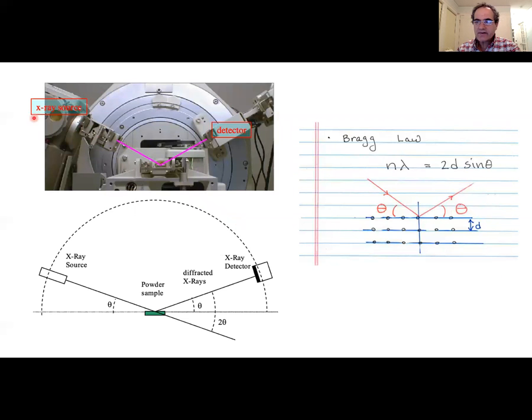We're going to analyze our data with an X-ray diffractometer like this, okay? So as we discussed in class, in this apparatus, there's an X-ray source, which produces a beam of monochromatic X-rays. They hit our sample, which will be mounted here, and then there's a detector. And the detector, of course, detects X-rays if there are X-rays scattered at this angle. When the experiment runs, the sample stays constant, doesn't move, and the X-ray source and the X-ray detector both move up. And we sweep out this angle, theta.